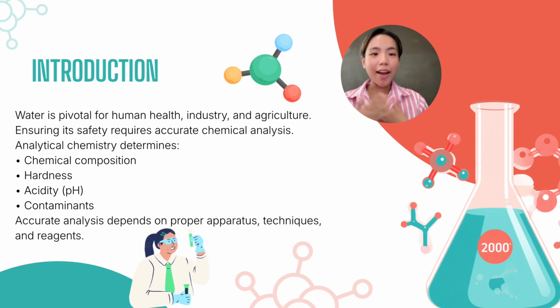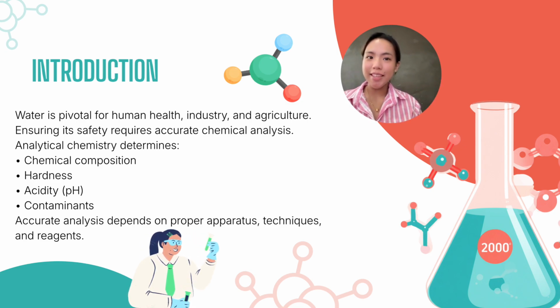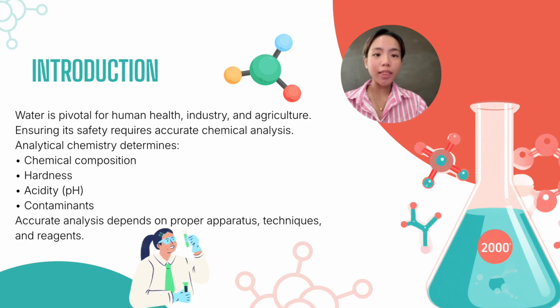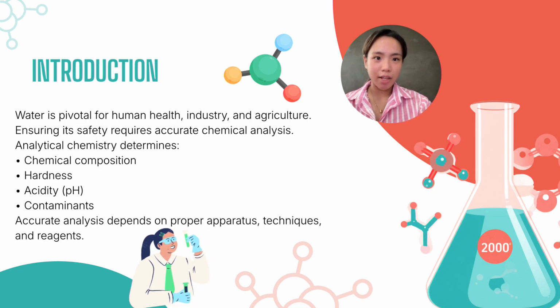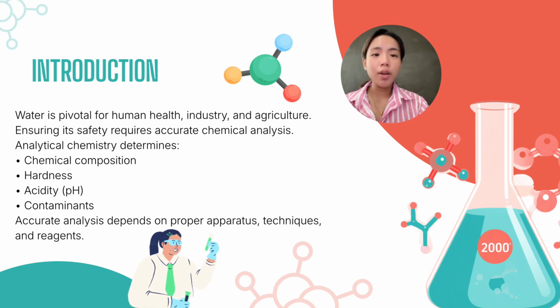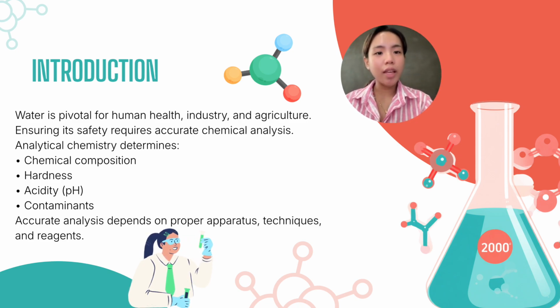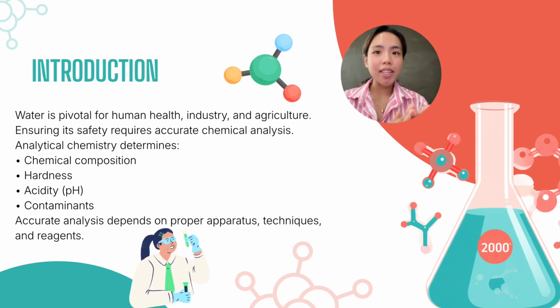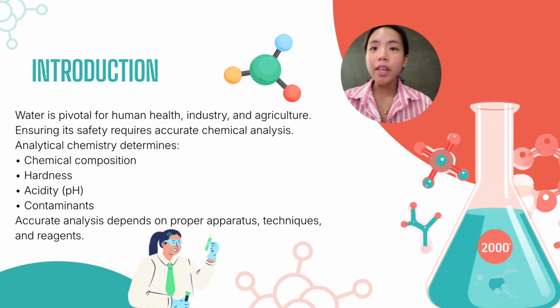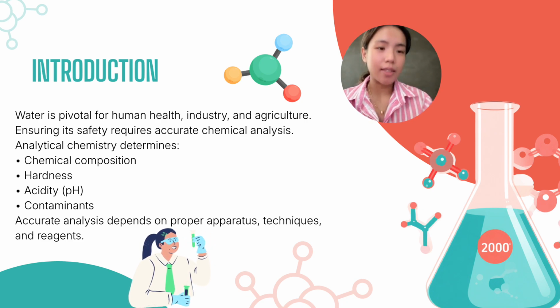Hello everyone, I am Nur Natasha and today we are diving into the applications of apparatus, techniques, and reagents in water quality analysis. As we all know, water is absolutely essential for human health, industry, and agriculture. However, ensuring its safety isn't something we can do by guessing. It requires accurate chemical analysis to determine the chemical composition, hardness, acidity, and contaminants. An accurate analysis depends on proper apparatus, techniques, and reagents.